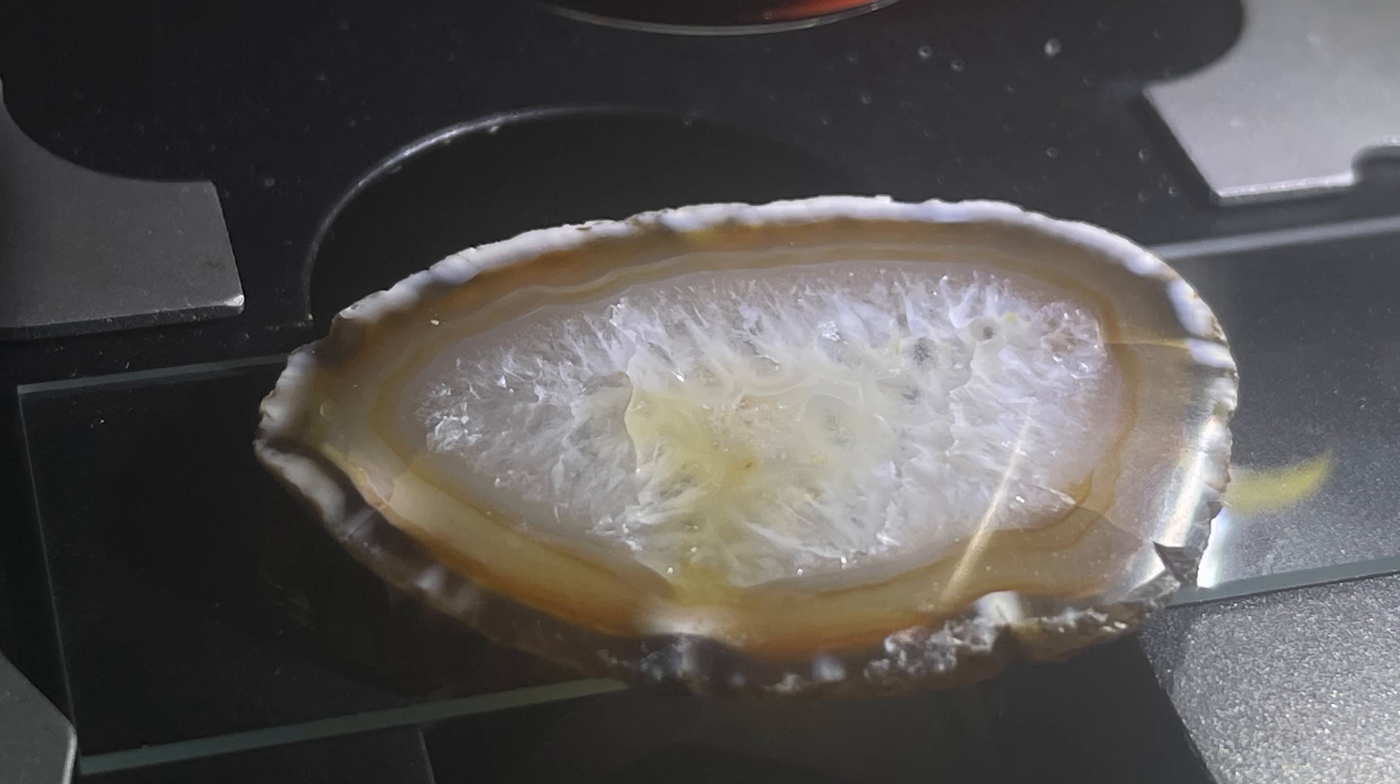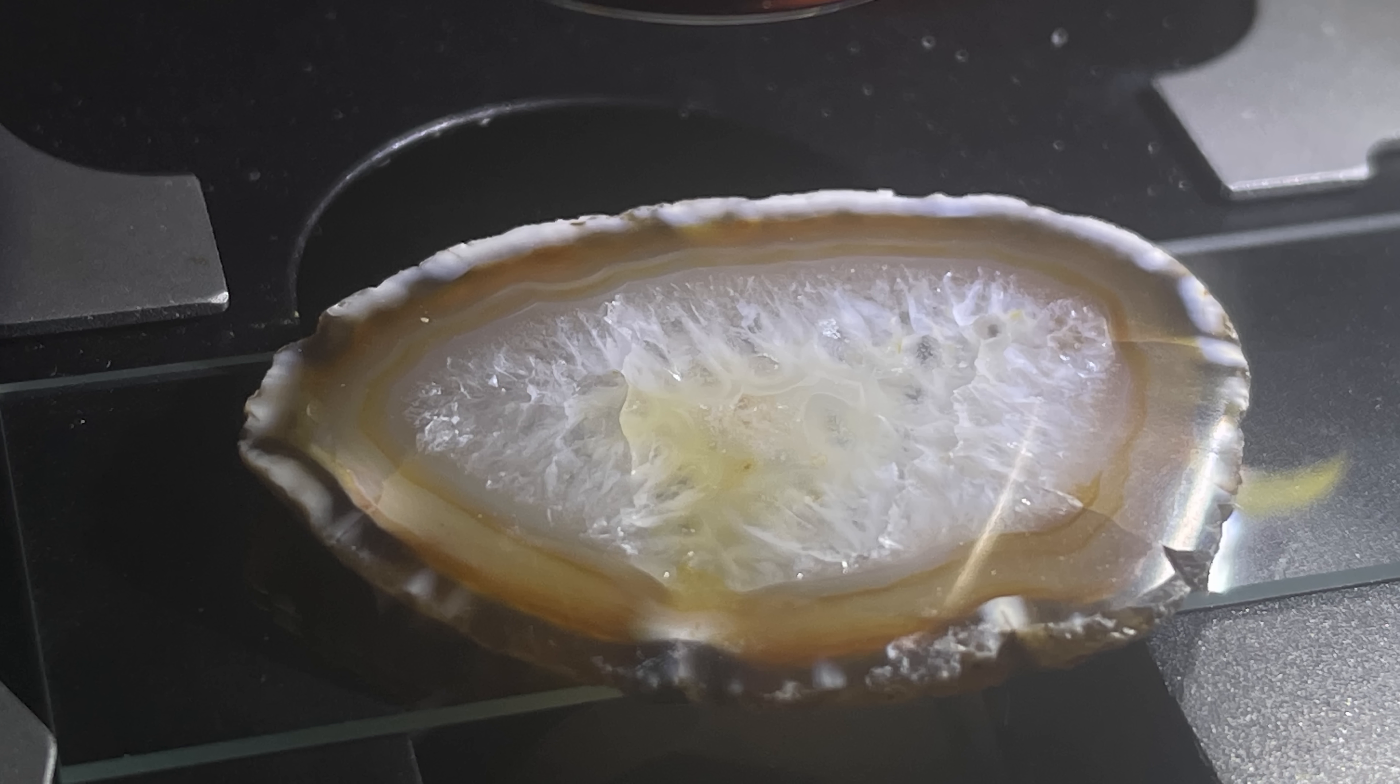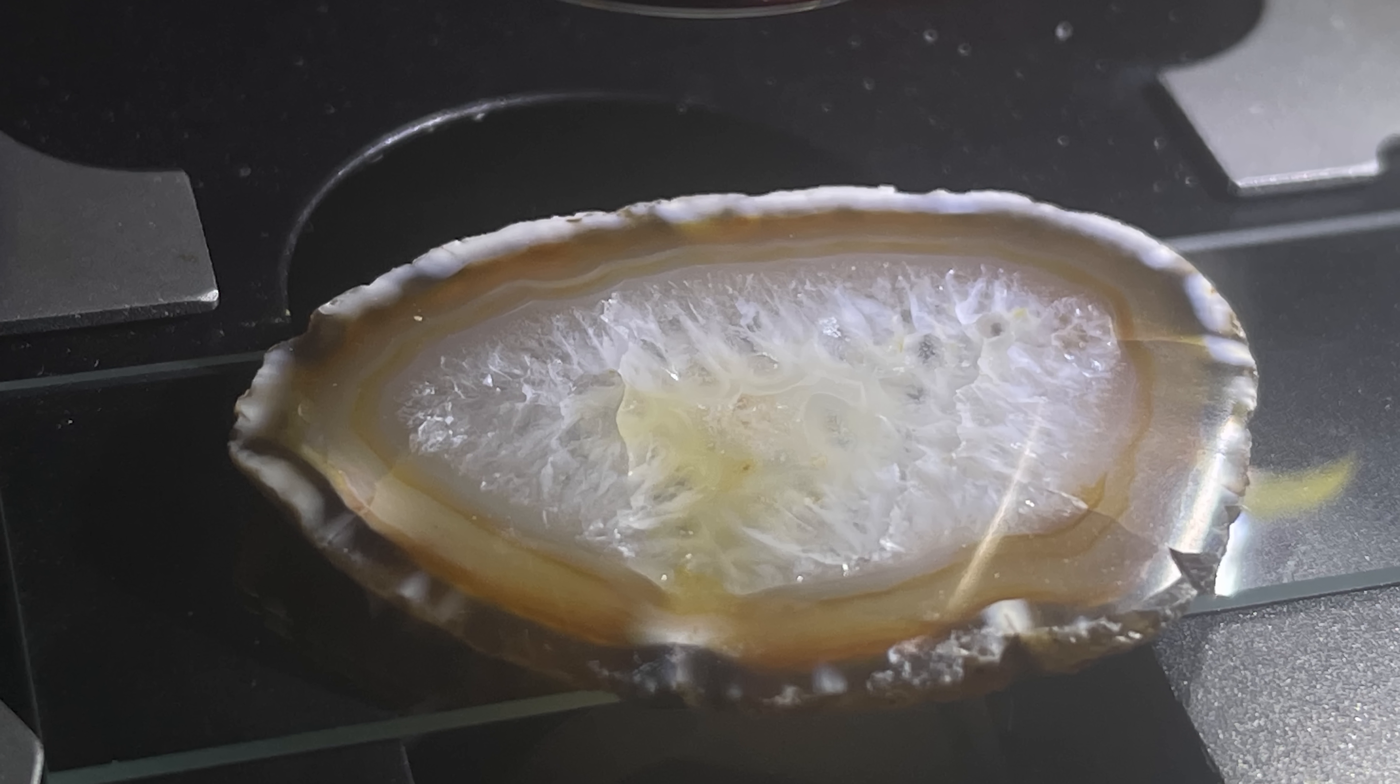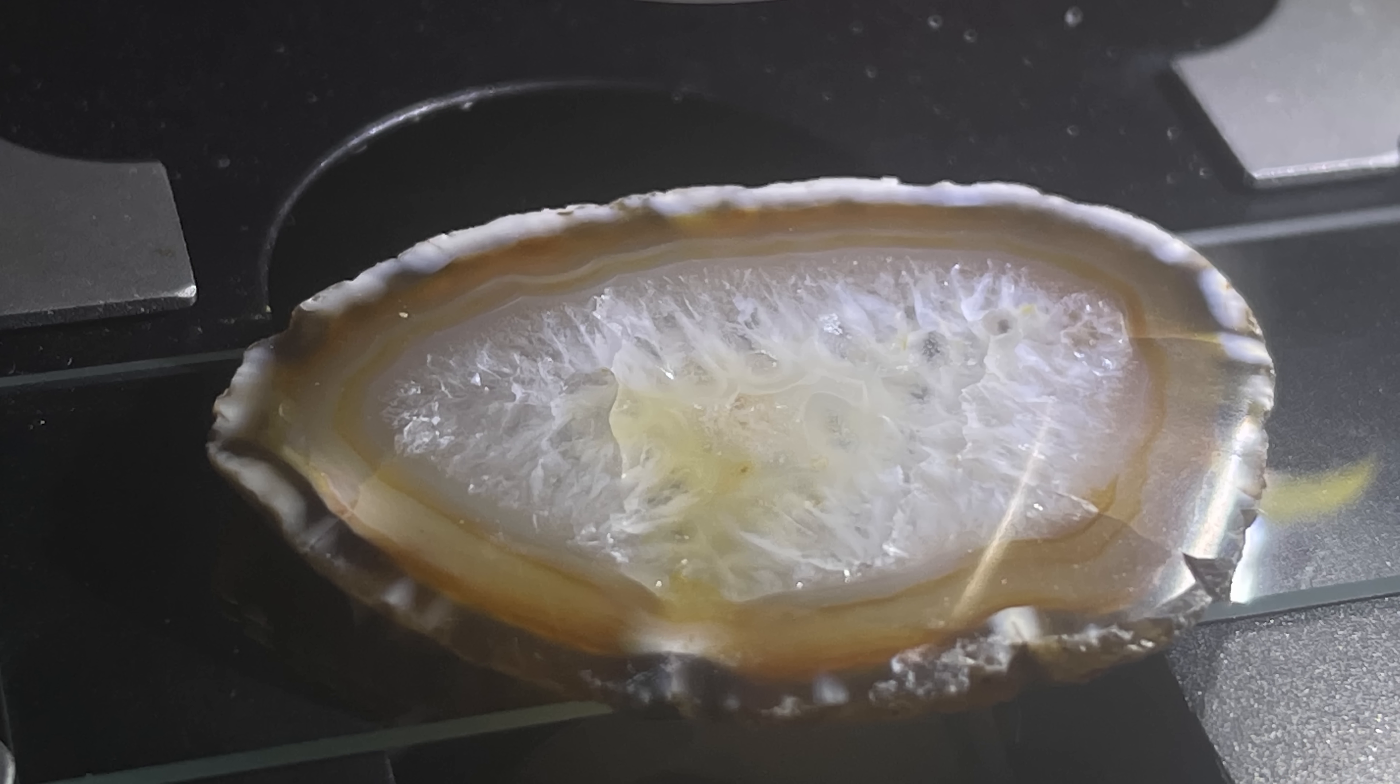Usually, James watches organisms on clear glass slides. You know, the typical slides used by microscopists all the time. But lately, he's been trying out something different. This is a geode slice that, as you can see, James has laid out onto his microscope. And even before we turn the microscope on, it is quite stunning.